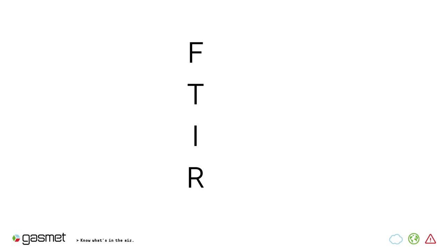It stands for Fourier Transform Infrared with, you could say a silent word, spectroscopy at the end. And before we go any deeper, what is spectroscopy? It is the study of how matter and electromagnetic radiation, which is basically light, interact with each other. This usually means studying how matter absorbs or emits light or other radiation.